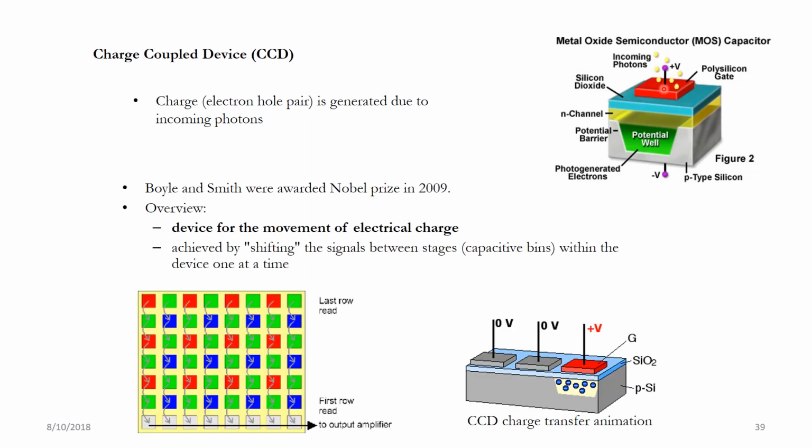Next, there is a change in voltage by pixel, and that way the electrons can be transported from one part of the chip to another, and that's how each pixel, once they record, can transfer the electrons back into the measurement device, which can quantitatively tell how many electrons were generated, and that way you can quantify how the image was originally, because this electron generation is directly proportional to the amount of light that hit that pixel.